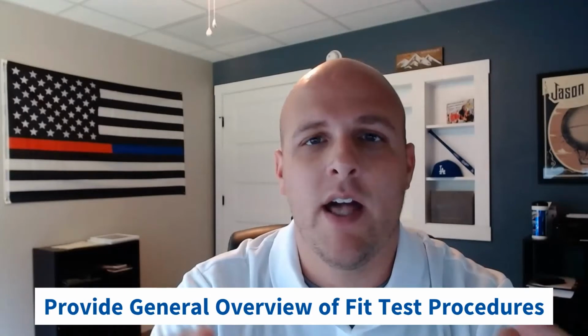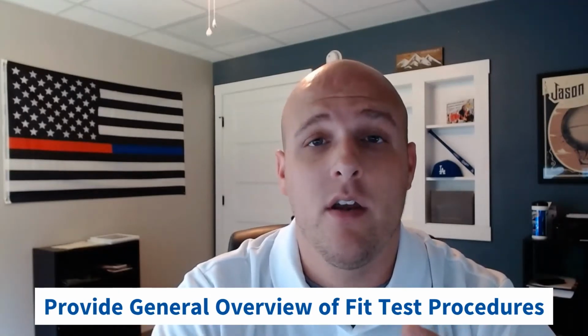And so looking at the training, we're going to make sure they're properly trained beforehand, do a quick refresher, and then give them a general rundown of what the test exercises are. We don't want to be explaining it to them as you go, because you're going to have a delay during the process, and you're not going to get an accurate reading. So you want to explain the whole process of the fit test procedure beforehand: the different stages, the different exercises, when they should do certain things, and when they shouldn't.